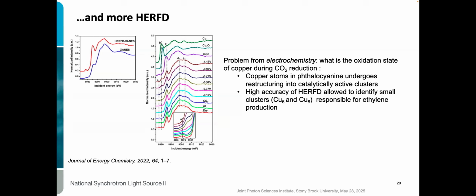Now, there's one caveat here. The ability to analyze the high-resolution data relies on understanding the theory well. And like this poster shows, analyzing XANES is not an easy task. So you need to rely, in many cases, on theory or different levels of DFT and so on, of course. But that's okay.